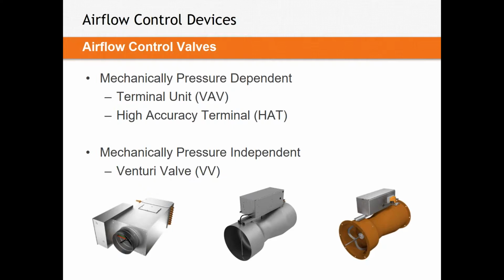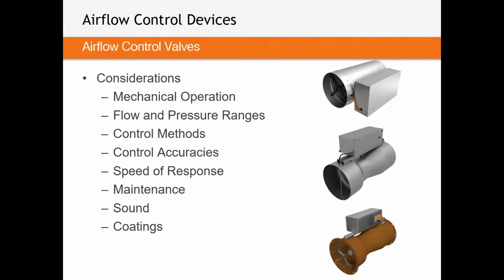Again, each one can be very well applied, but each one is different. And so what we're going to do here over the course of the next half hour or 45 minutes is kind of break down how they are different and how to apply them. So we're going to start first with the mechanical operation. My one end goal for today is that the group can understand mechanically the difference between these products. And most importantly, if you look at those three images on the right, really the difference between the bottom two images, because while they look identical, mechanically speaking, those two types of valves are as different as can be.